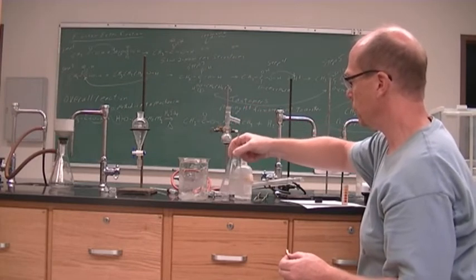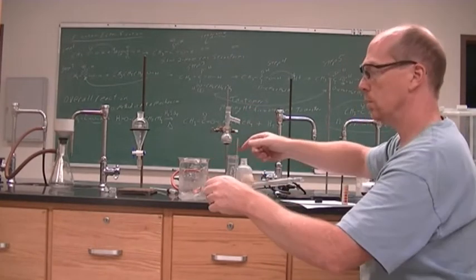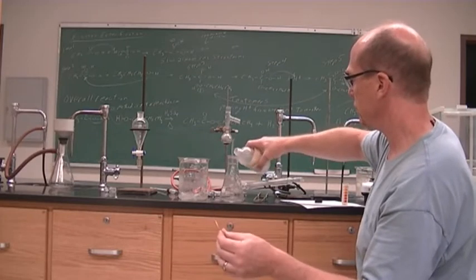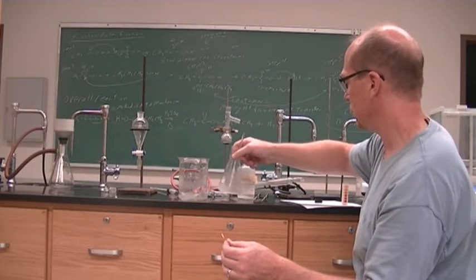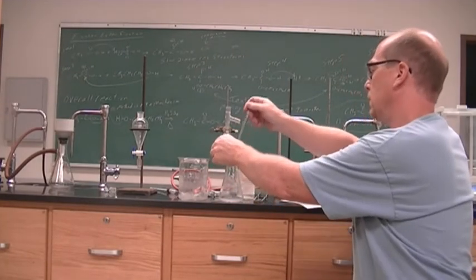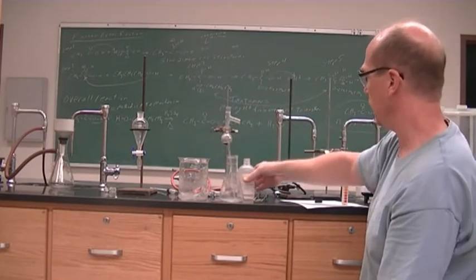Few bubbles. See where we're at now. Still got a red tint to it. We haven't neutralized it yet. Might be a little pink in there too. I saw a little pink. All right. Oh yeah, I see pink. All right, so when this solution turns a light pink, we're going to know that it is where we want it to be.